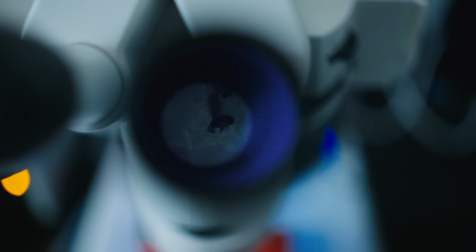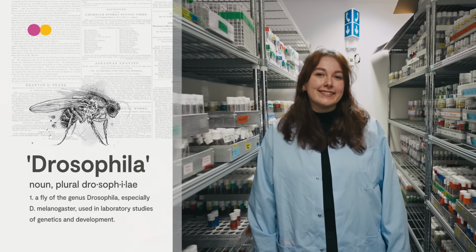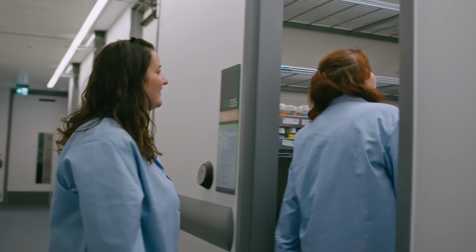Hannah's job is far from your typical academic science role. She's a Drosophila technician. That's fruit flies to you and me. She looks after over 8,000 of them, and I'm about to learn how this job changes the world. Let's go and see what all the buzz is about.